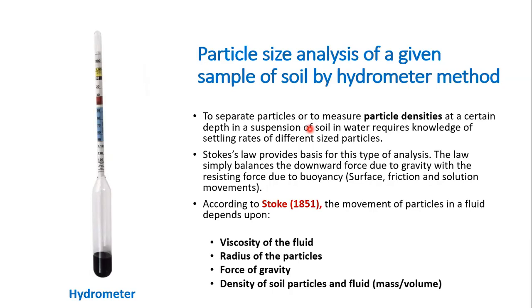For that, we need the particle density of the soil particles and the density of the fluid we are using. Stokes law provides the basis for this type of analysis, and the law simply balances the downward force due to gravity with the resisting force due to viscosity.